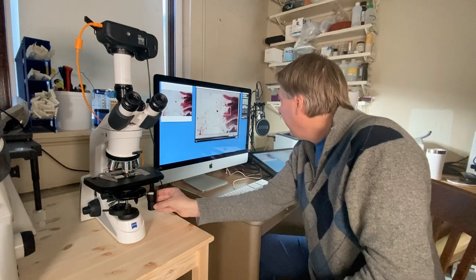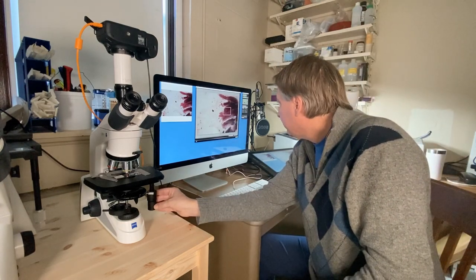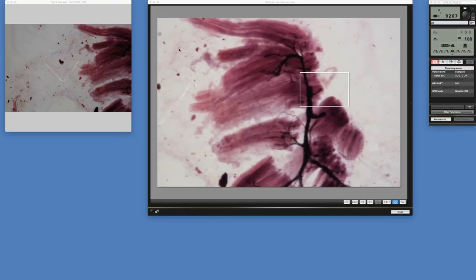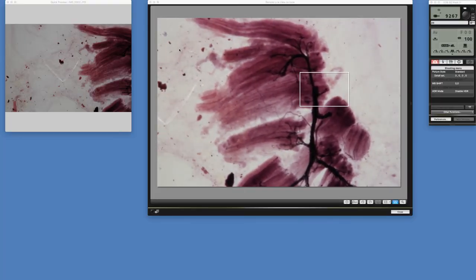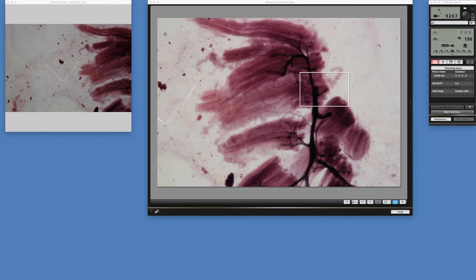Now we want to take a look at the neuromuscular junction. You can see here that this dark fiber is a nerve cell — these neurons are connecting to muscle. This pink material here is muscle fibers, and the neuron is right here synapsing with the muscle at the neuromuscular junction. So we can go up to a higher magnification.